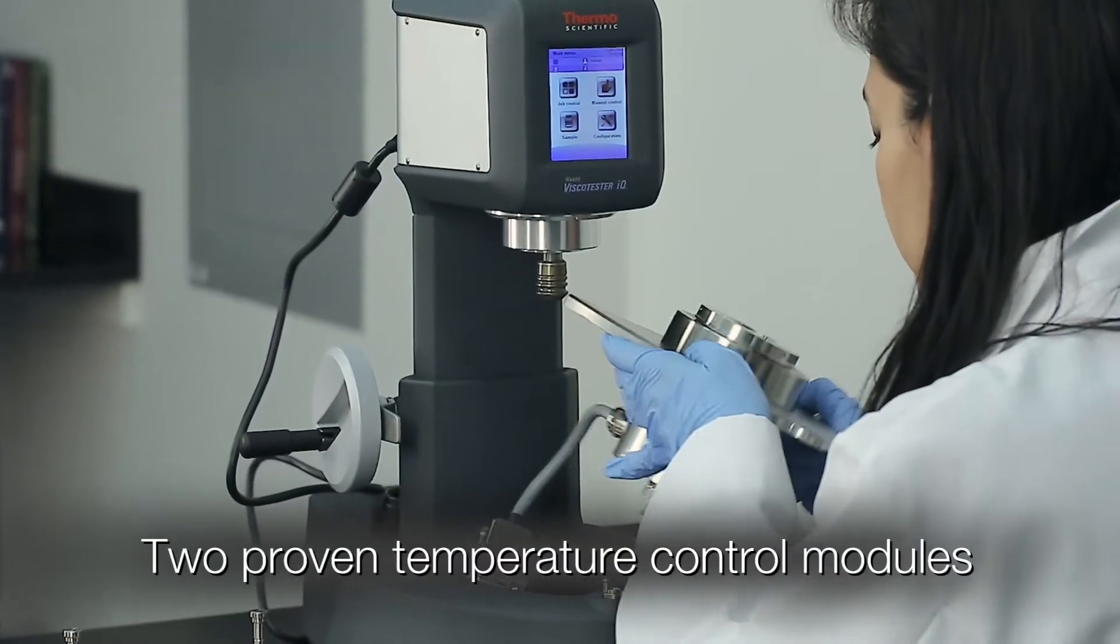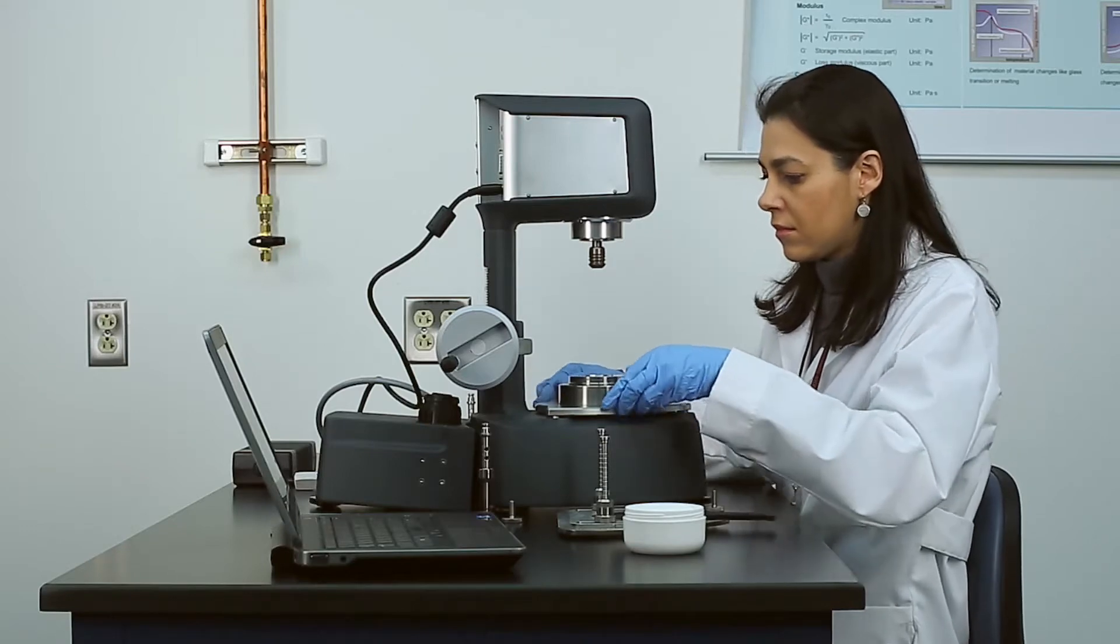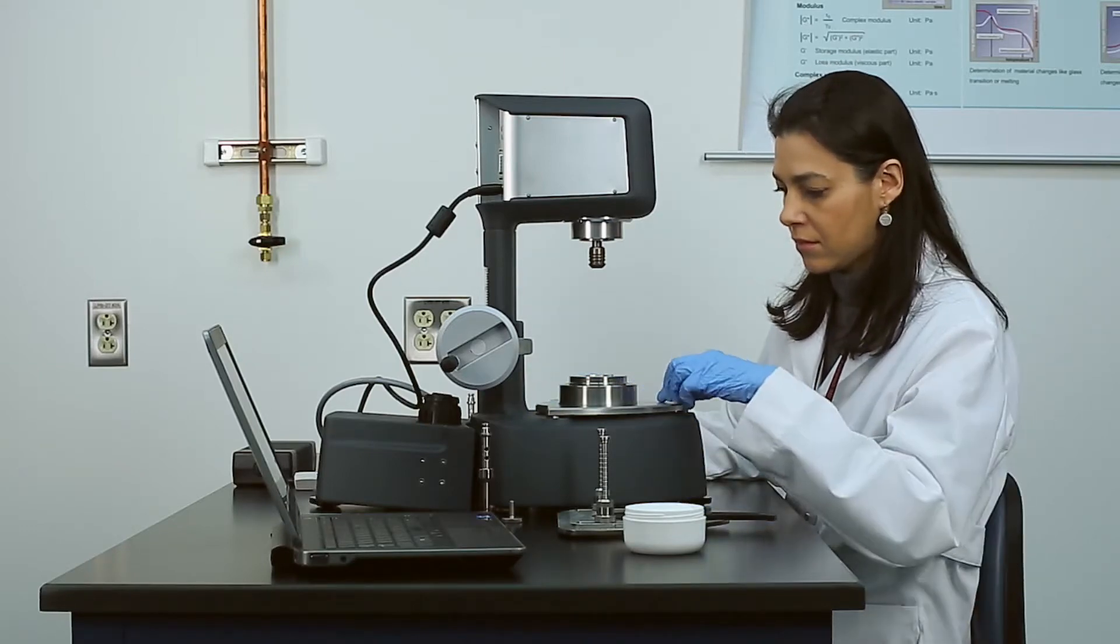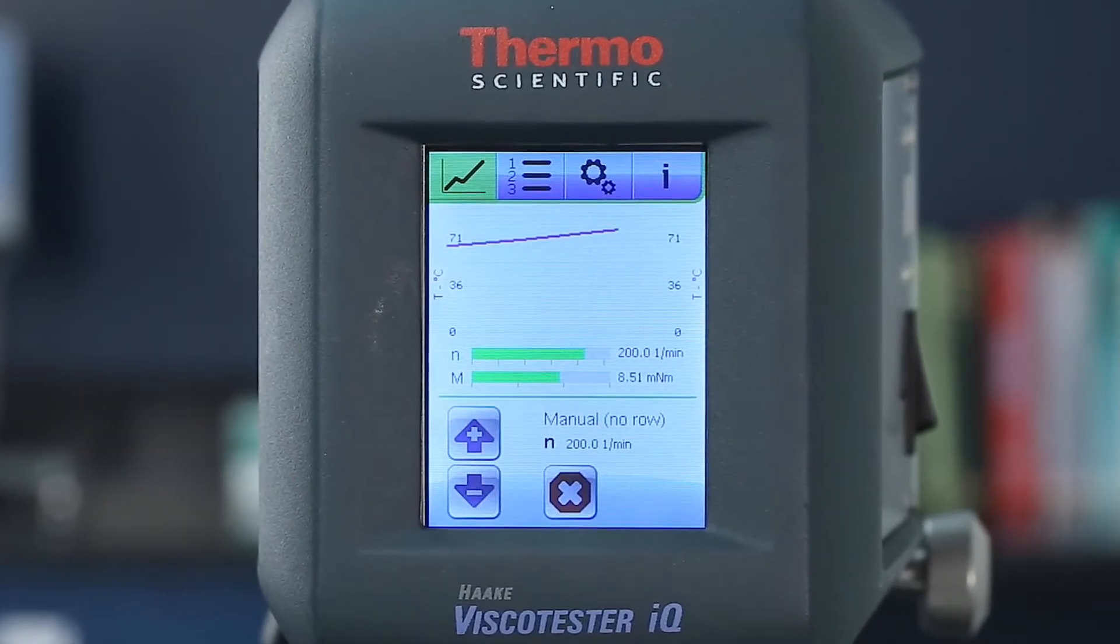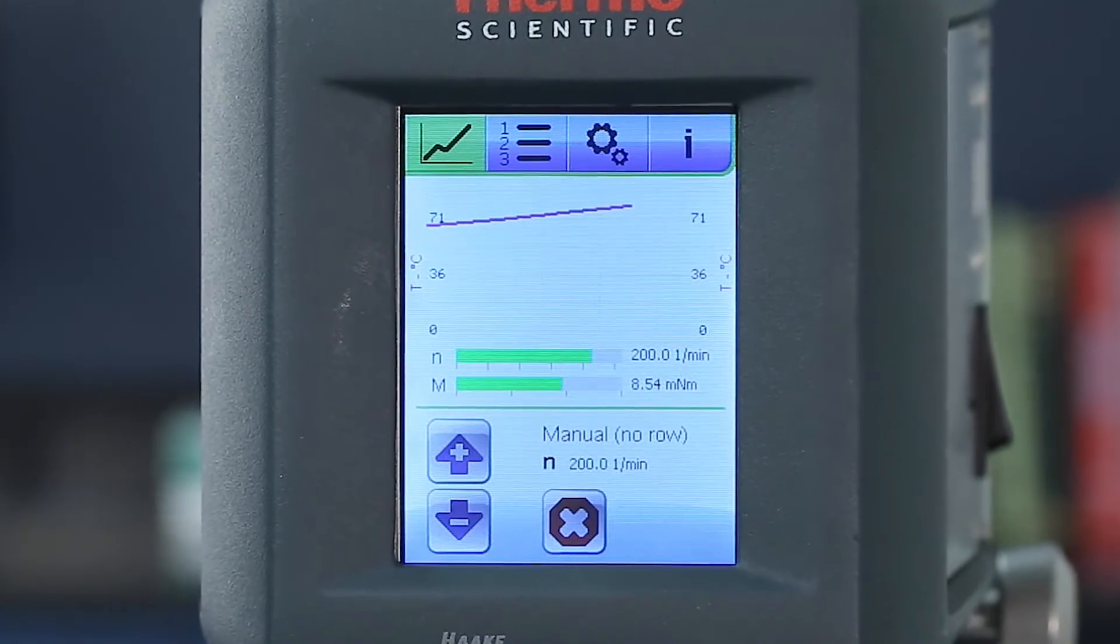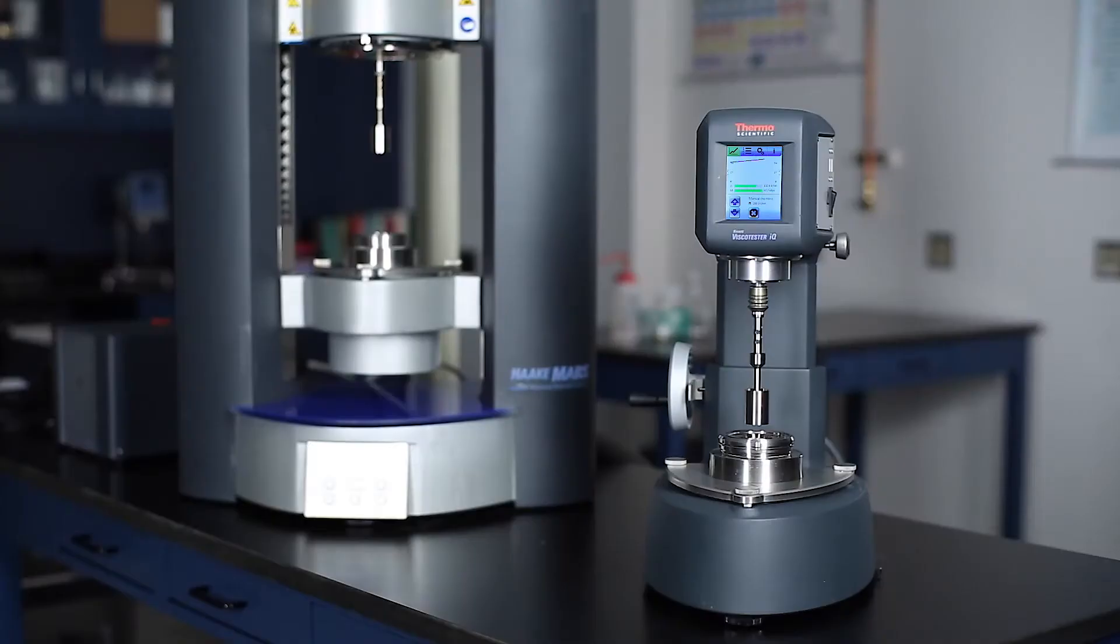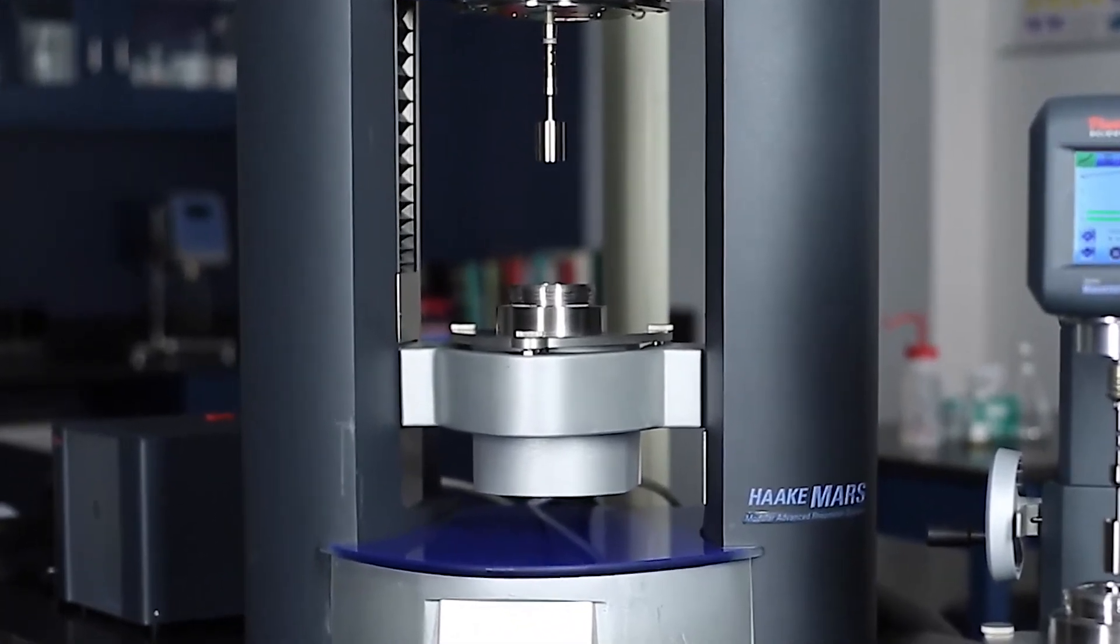Two modules are available for reliable temperature control, including a self-contained Peltier controlled unit. For maximum temperature range, the liquid controlled module spans minus 20 degrees Celsius up to 180 degrees Celsius. Both units are modeled after our successful high-end modular rheometer, the ThermoScientific Haake Mars 3.